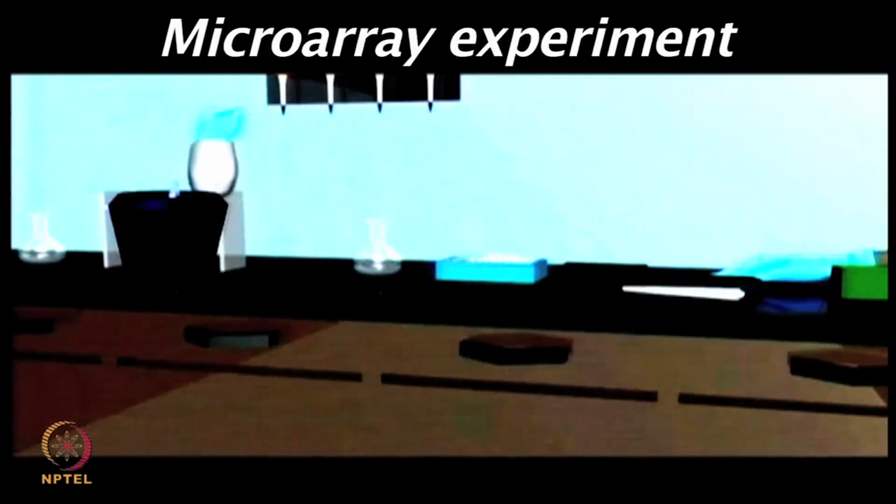Now, after the washing step, apply the secondary antibody, for example, anti-human IgG, and again appropriate dilutions can be selected depending upon what dilution works best in your experimental setup.